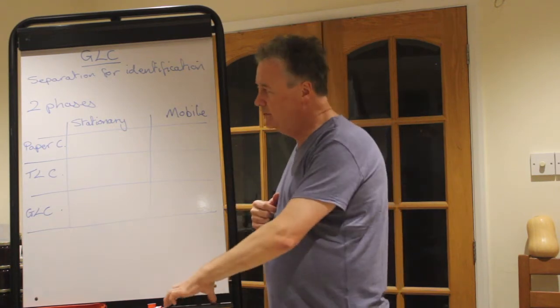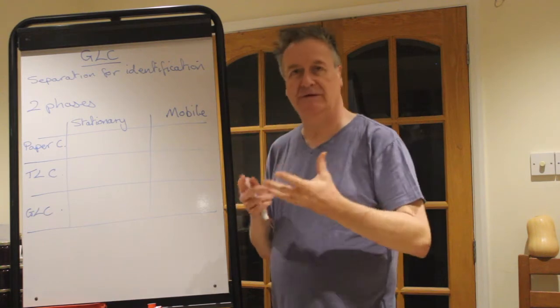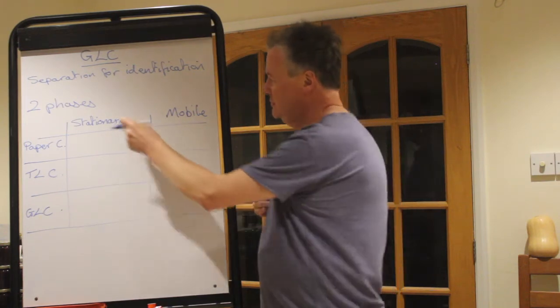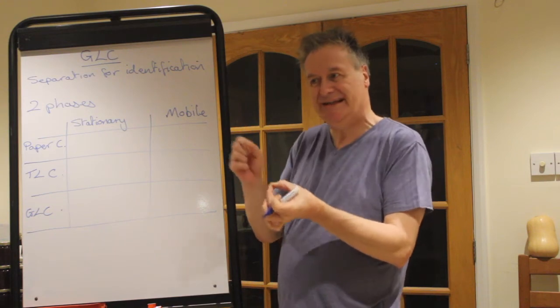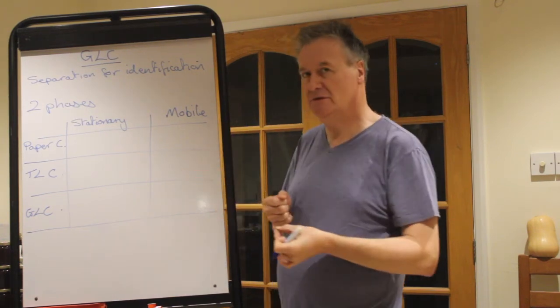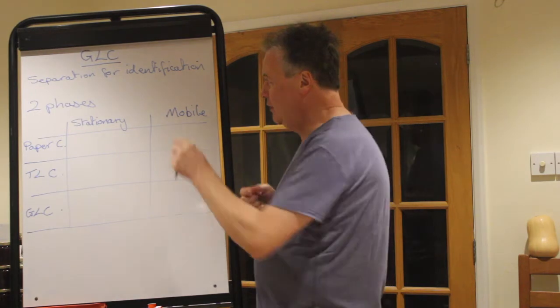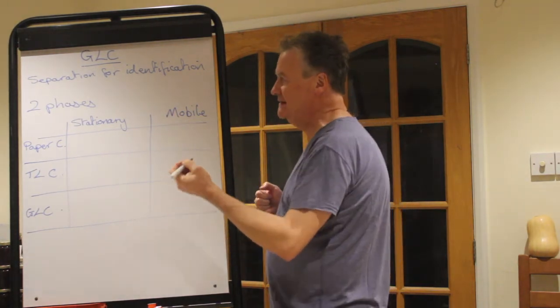So when you look at paper chromatography, you will remember doing those ink chromatographies. The ink is not the stationary or the mobile phase. The chemicals you're looking to take apart from each other are not the phases that we are talking about. The phases are the inherent parts of it that are either one of the two things you put together and then put your mixture onto in some way or another.